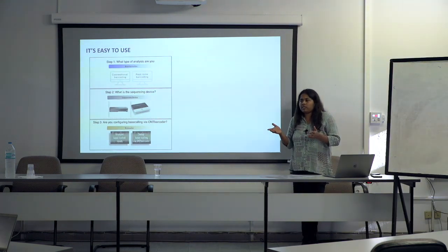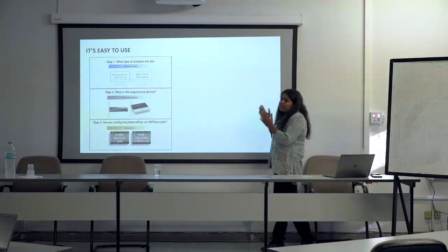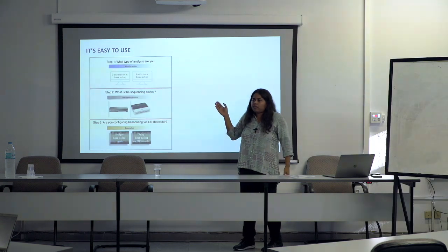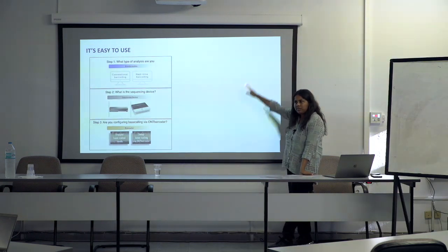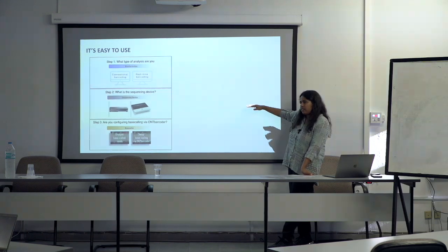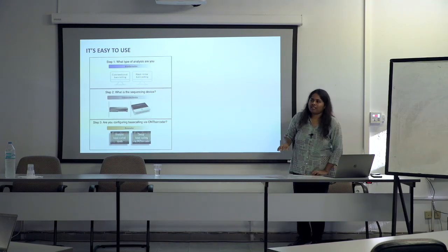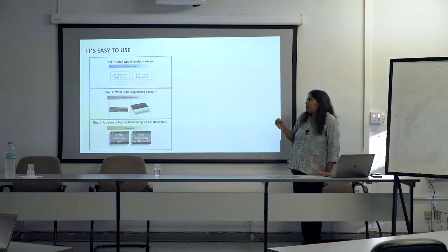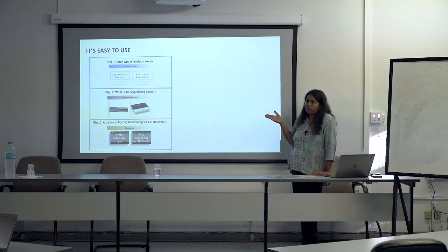People have been doing it for bacterial 16S with nanopore for a while now, so it's not that it's not possible, but there is an error rate there. When you're doing these massive multiplex data sets with uneven coverages, those error rates vary with coverage as well. I don't think it's a MAFFT or a bioinformatic issue, it's a data issue. But I think we haven't explored enough with the 10.4 yet to know.